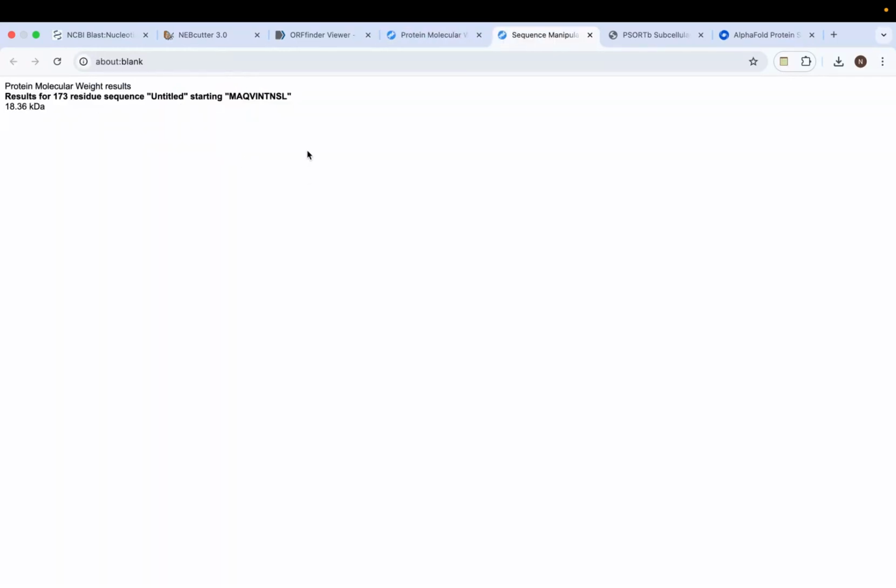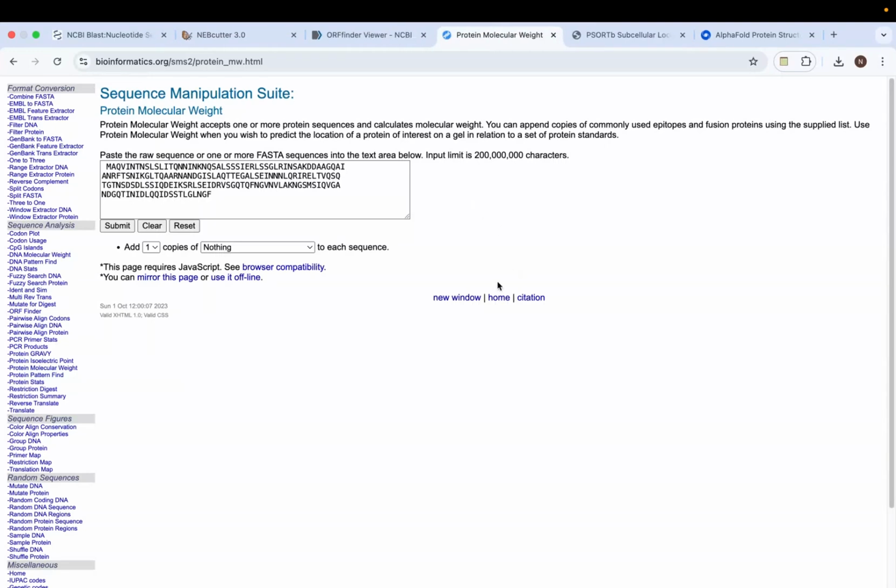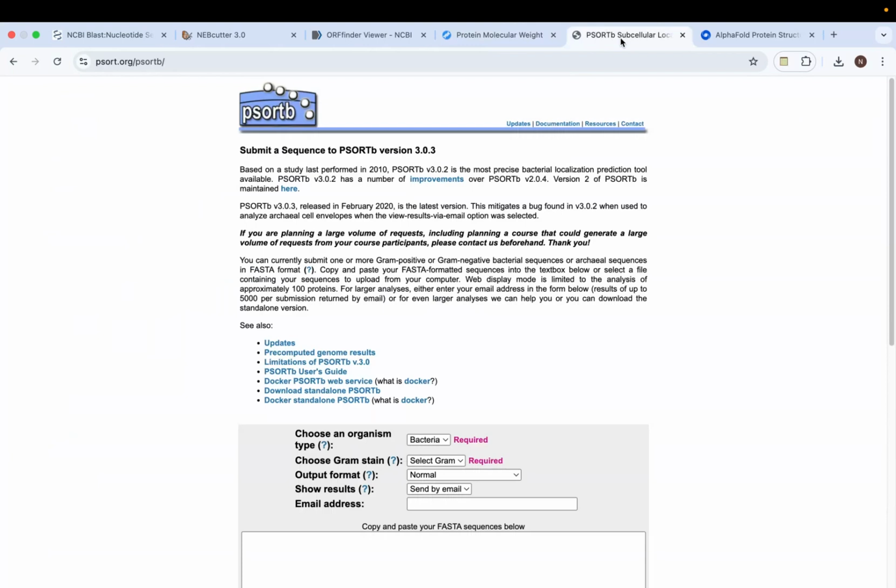You don't need to screenshot both of these numbers, but you do need to have it in your assignment, I believe. Okay, so yeah, note down the numbers. Our second last website is PSORTb.